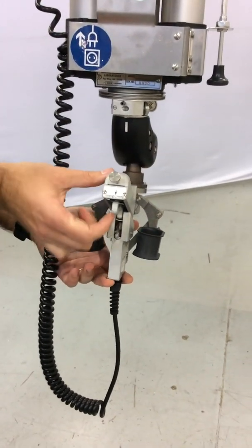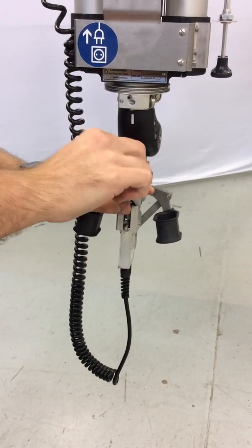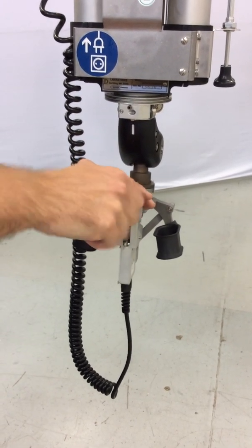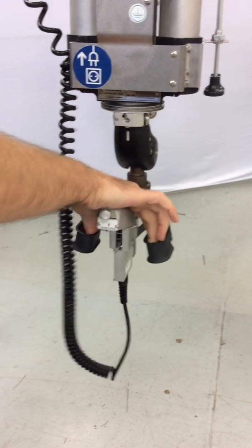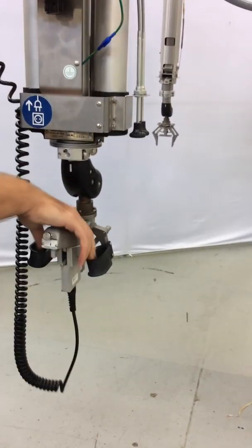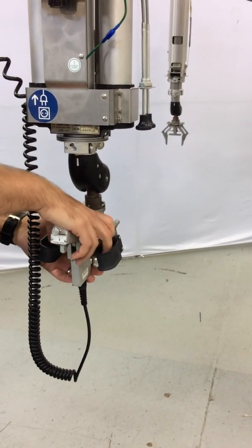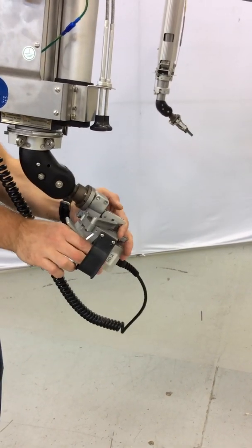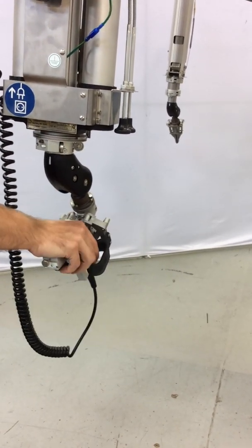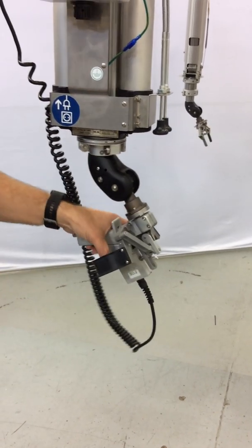You can also lock the trigger in the release position with the thumb screw, and that will allow you to operate the tong without the ratchet in use. You can hold this ambidextrous handle left or right handed, and it operates the same way.